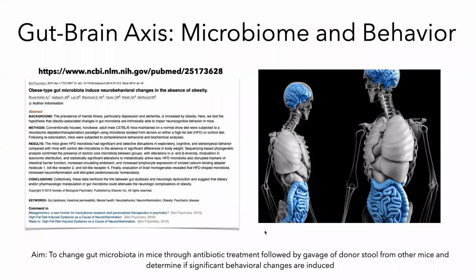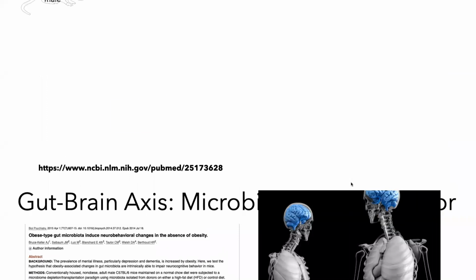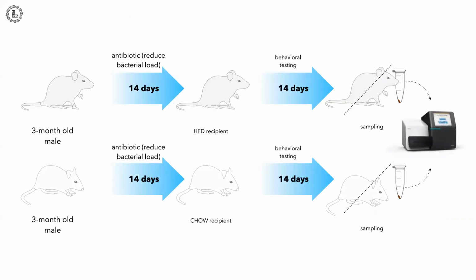As I mentioned, we will also take a look at projects that have some indirect associations between the microbial community, for example the gut or fecal microbiome, and general state. For example, anxiety is a psychological condition, so what might be the relationship between the two? We'll see how the specific experimental design and different types of data available in the project as a whole can help us study that kind of microbial variation.